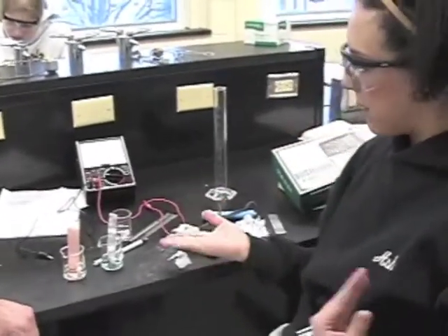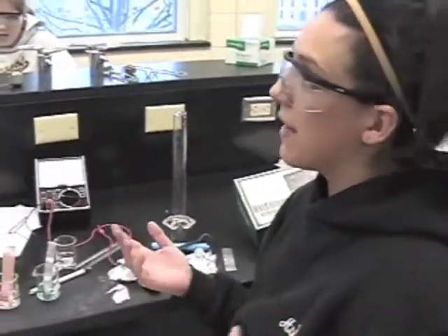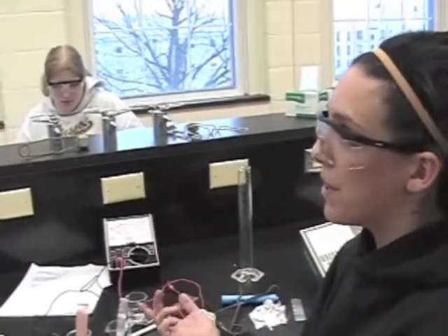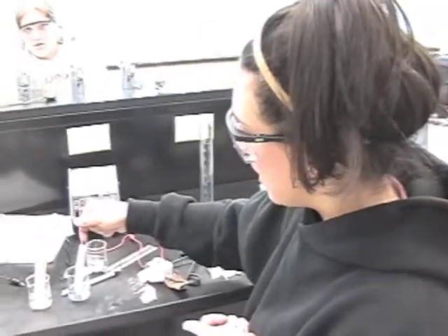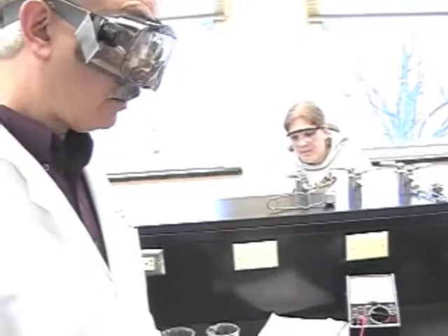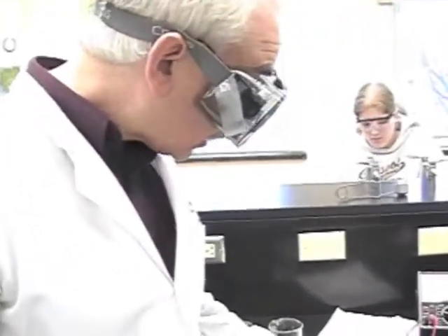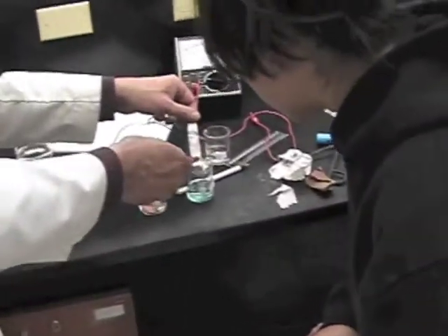The lead, when it is placed in the copper sulfate, is dissolving and giving off electrons. Yes. So then they reduce the copper ions, forming copper solid, which deposits onto the white strip. And what color is the copper solid? It's like a brown. Ah, so you see that on there? Yes. But that looks like a white solid. It doesn't look like it's just the lead underneath it.